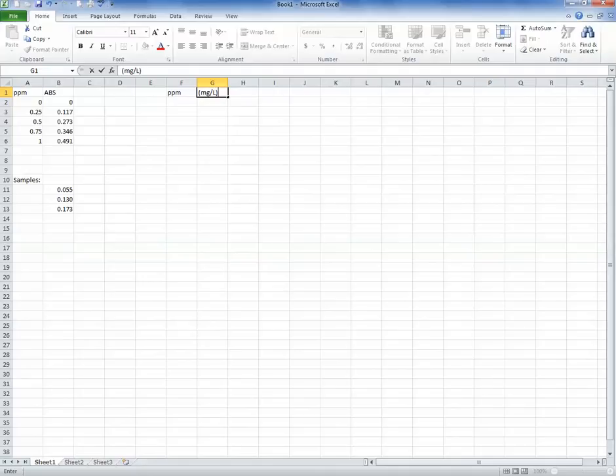Those concentrations will be provided to you in your lab practical or in your competition event. It will actually have the calculation, at least for one of them there. And then you'll maybe have to do a series of dilutions, and you'll have to calculate your own concentration using the dilution formula, but it will at least give you a place to start.